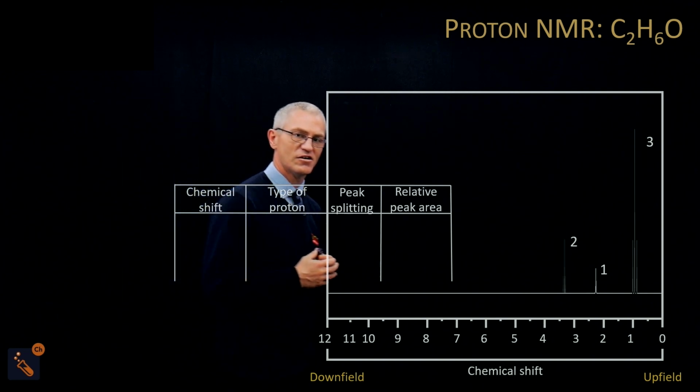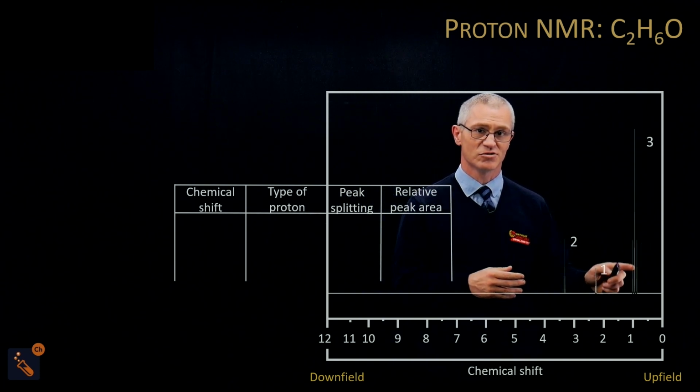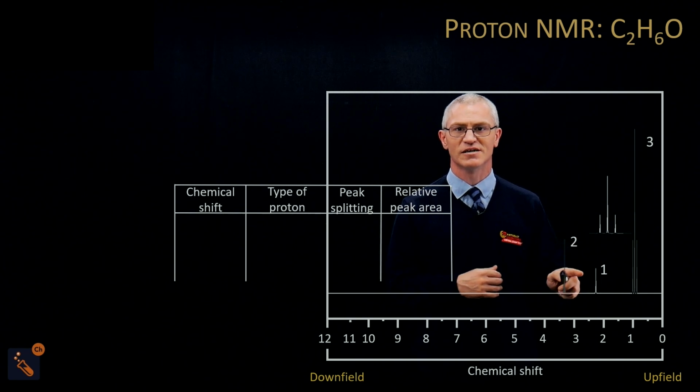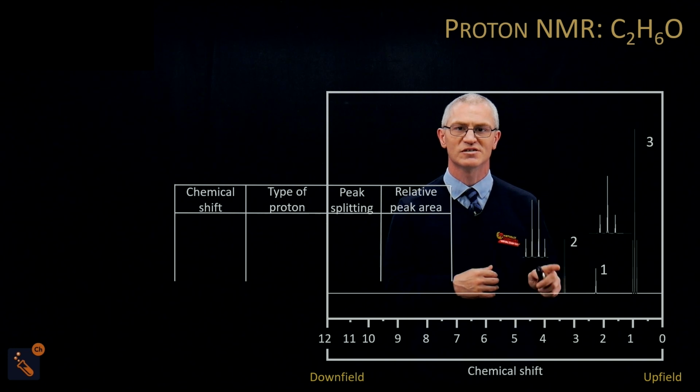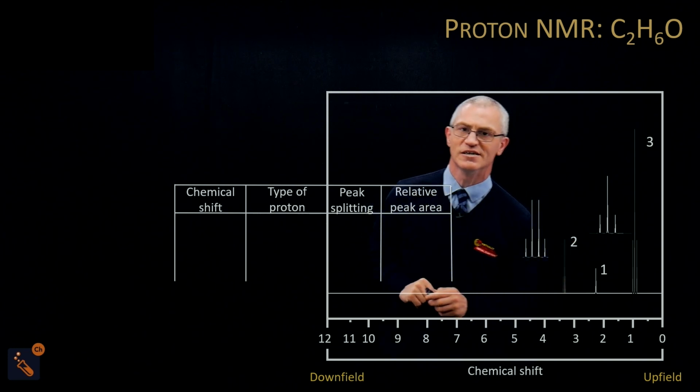So we'll start at our NMR, and let's look at what peaks we've got. So that looks like a triplet. So let's zoom in. Yes, it is. This is a singlet. You can see it's just one single line. And then we can see that one there, not a very clear peak, but we expand it out, and it is a quartet.